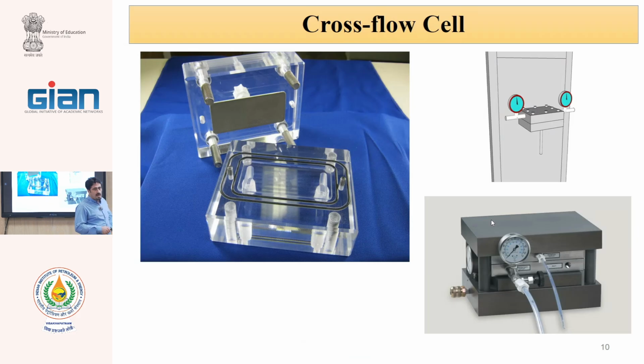Another setup is cross-flow. We use cross-flow mostly for RO and nanofiltration membranes. If we have a low pressure, use the plexiglass one or polyethylene one.